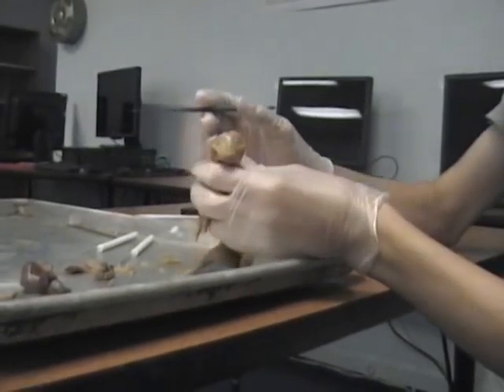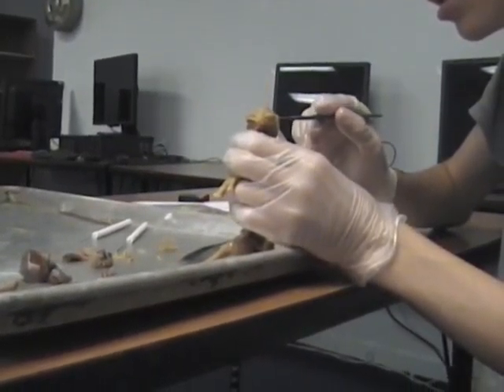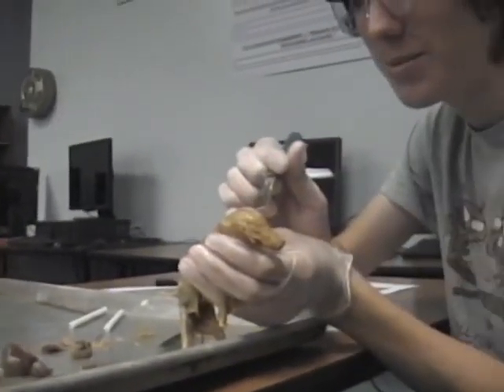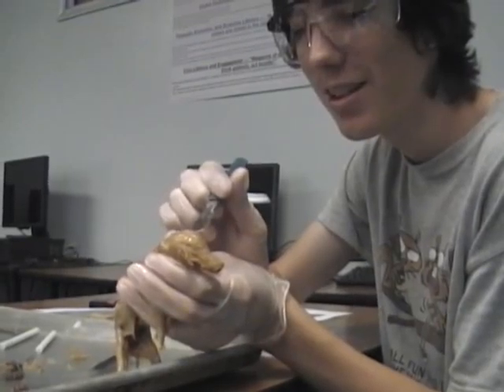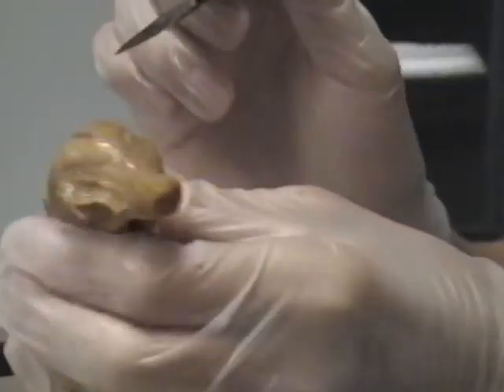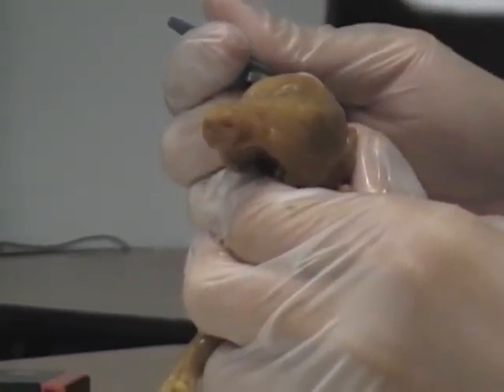Big deal. This moves the tail. Oh, nice. Yeah, we were pulling that. And the tail was moving. The brain. Oh, squishy. Another thing you can do is you can unfurl these intestines. If you start just, you can start.